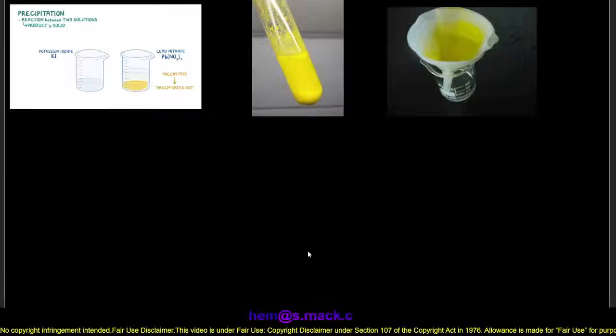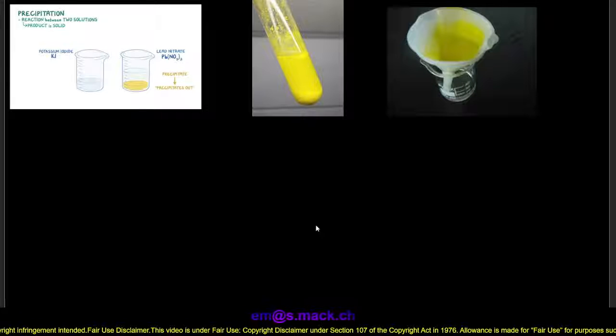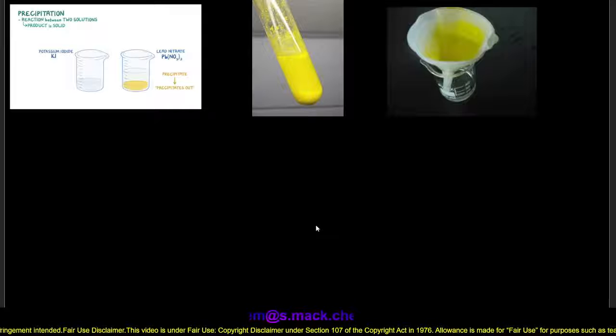Hi guys, in this video, we're going to look at preparation of lead iodide.